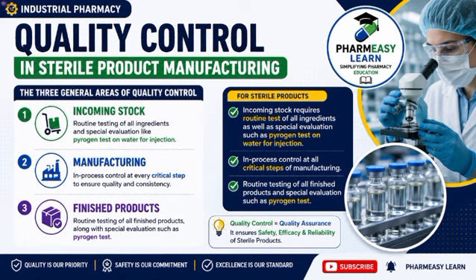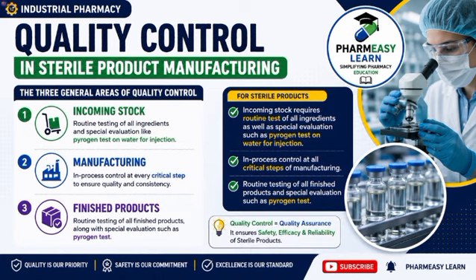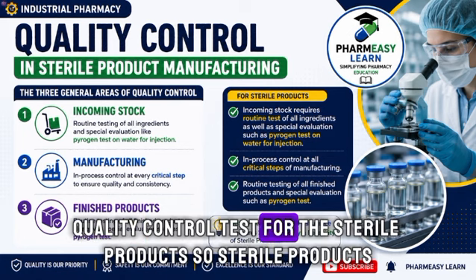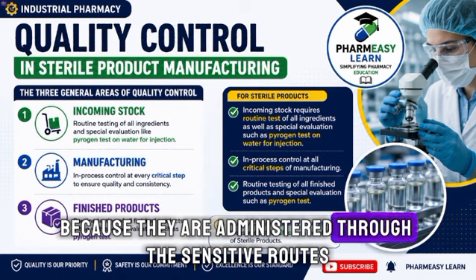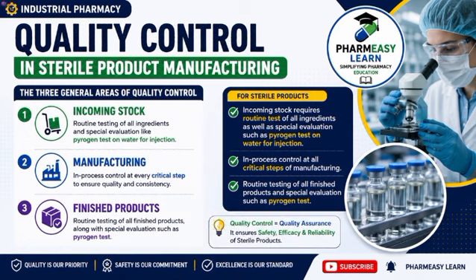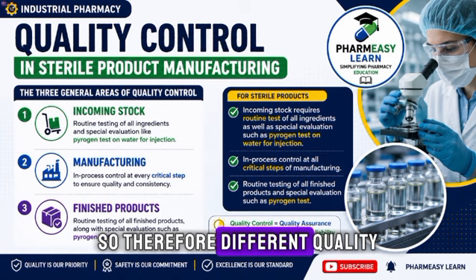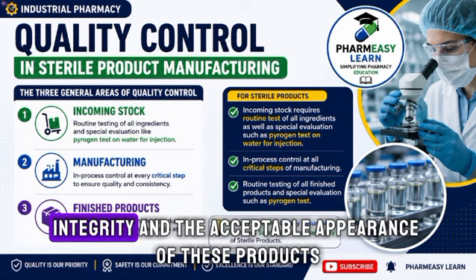In today's video, we are going to discuss an important topic from industrial pharmacy, that is the quality control test for the sterile products. Sterile products must meet strict quality requirements because they are administered through sensitive routes such as injection, infusion, or ophthalmic application. So different quality control tests are performed to ensure the safety, quality, integrity, and the acceptable appearance of these products.